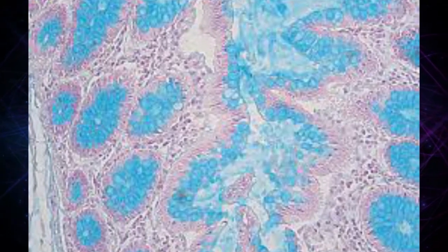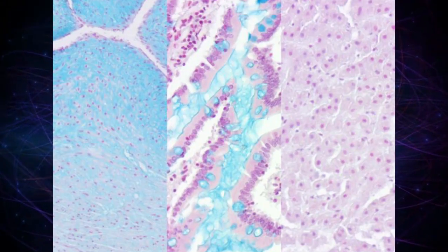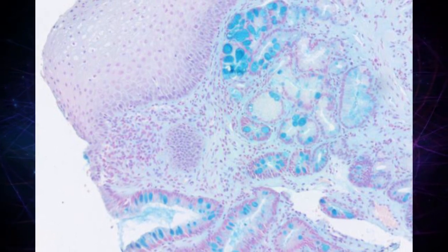The Alcian Blue stain is most commonly used on tissue samples obtained from the gastrointestinal tract. In this video, my main aim is to show you Alcian Blue stained slides. Hope this video is helpful for you.